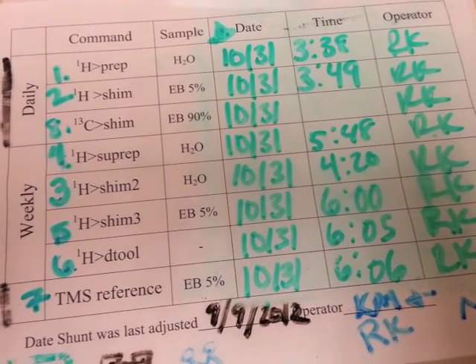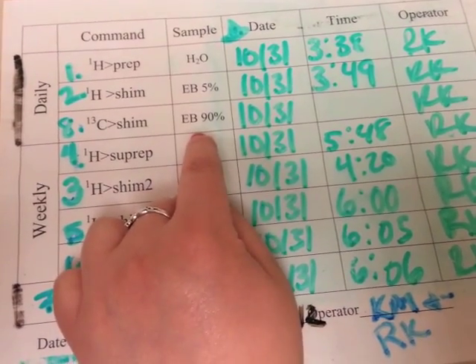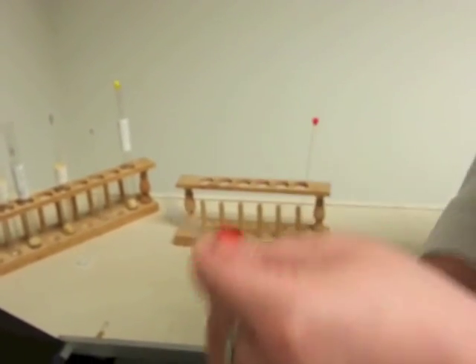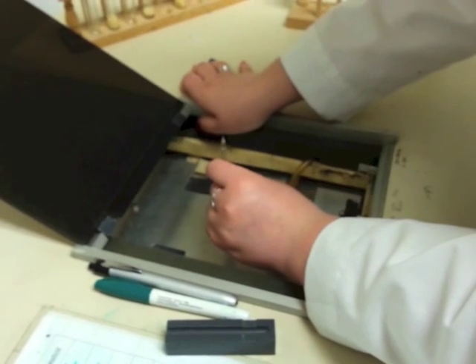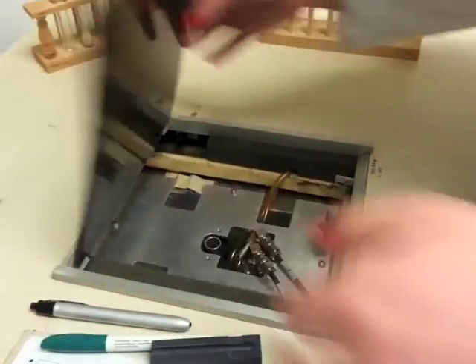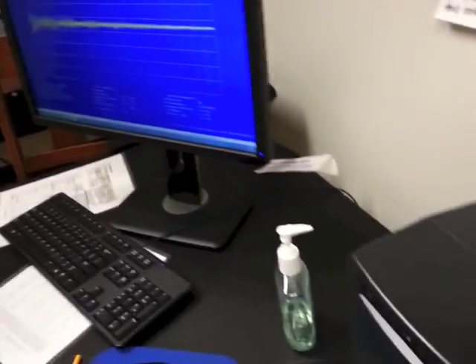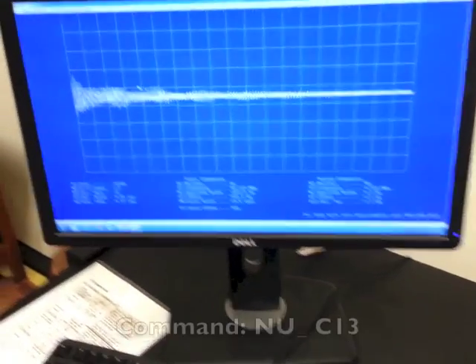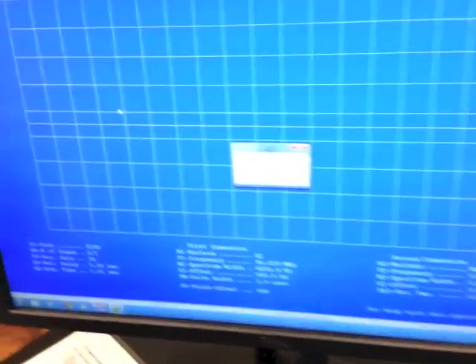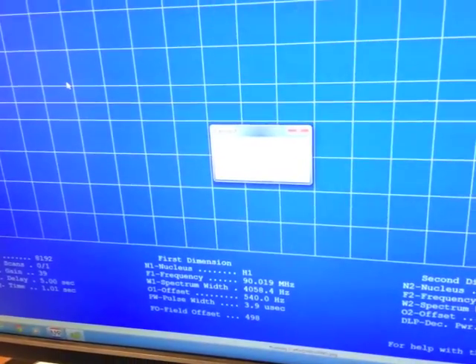The last step, if you're going to be running a C13 NMR, is to shim C13. For that we need a 90% ethylbenzene solution, which is kept next to the 5% one. It also has a label indicating it's 90% ethylbenzene. Come over to the machine and first type NU space C13 to change the nucleus to C13, and then SHIM. Since we're using a 90% ethylbenzene standard, we want to use a relaxation delay of two seconds.